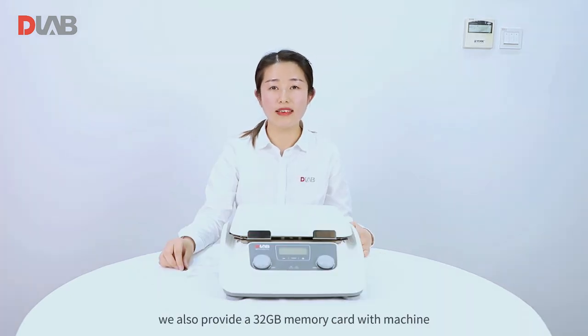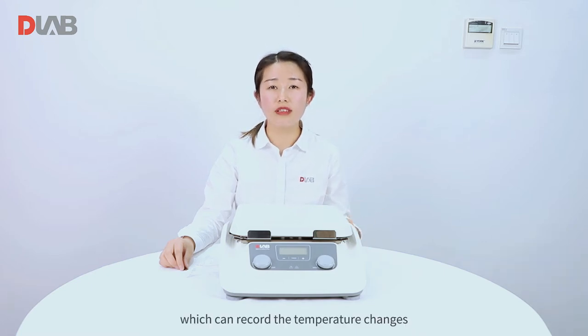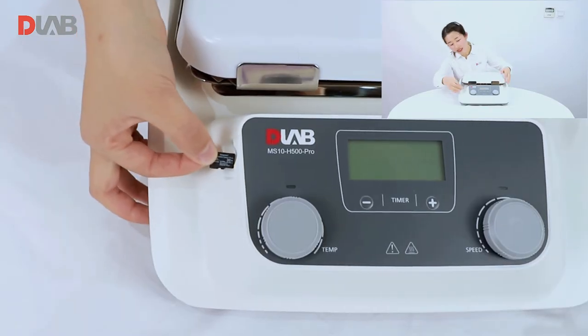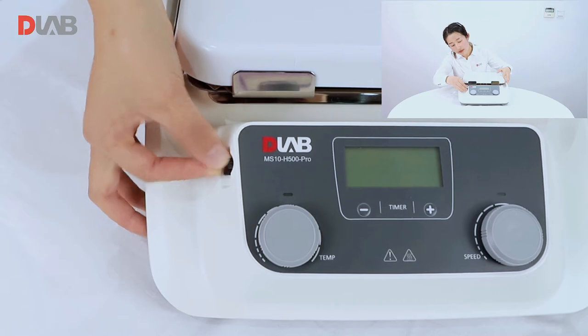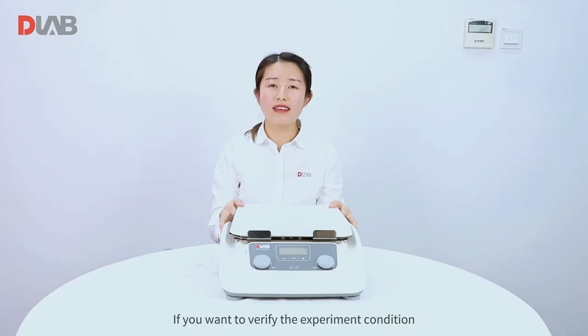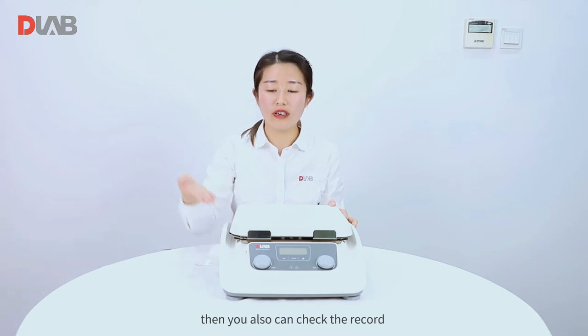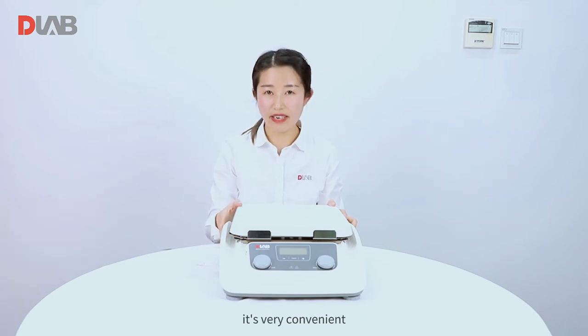Additionally, we also provide a 32 GB memory card with the machine, which can record the temperature changes during the whole experiment when you are absent. You can see here. If you want to verify the experiment conditions, you can also check the record in this memory card. It's very convenient.